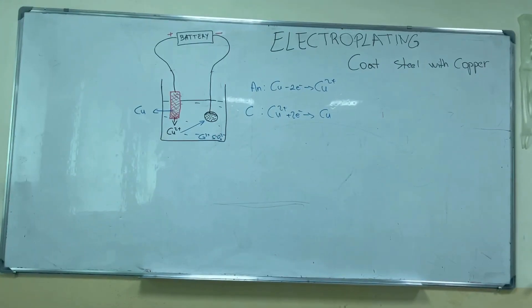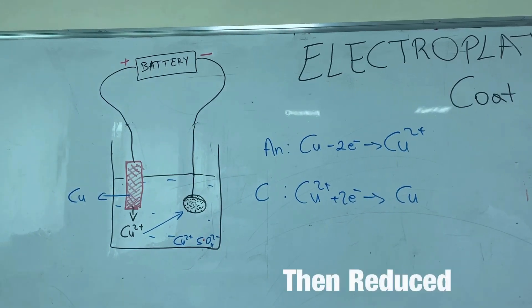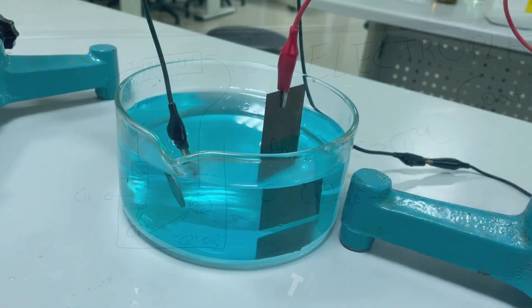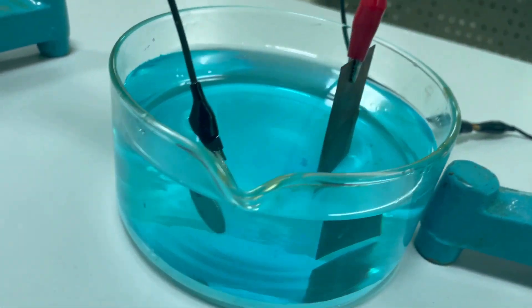Now we are going to coat steel with copper by electroplating process. In this experiment we need a copper sulfate solution, a copper electrode, and a steel coin electrode.